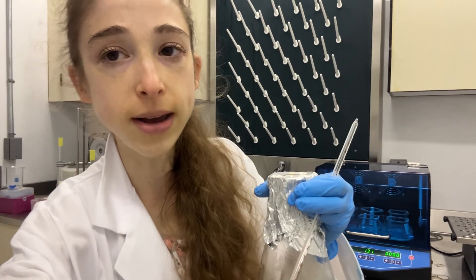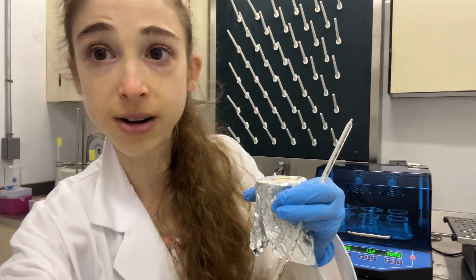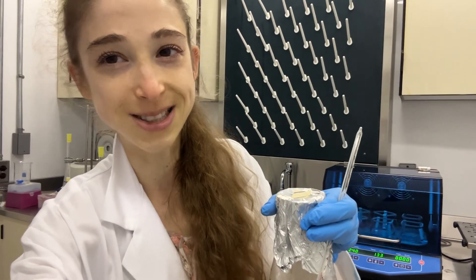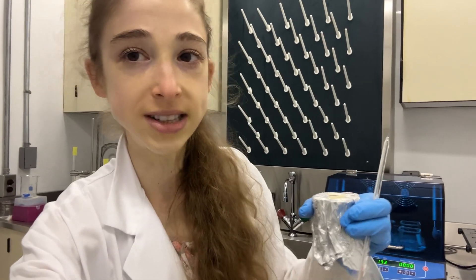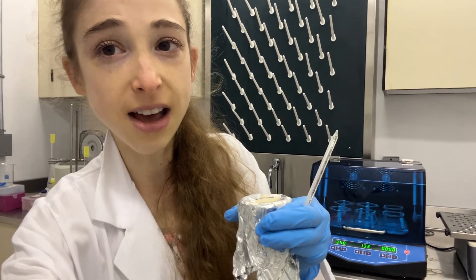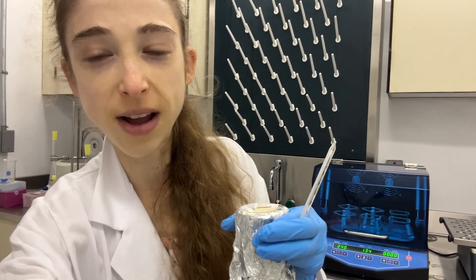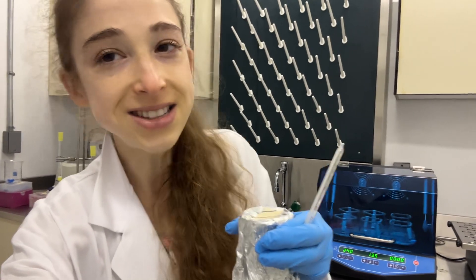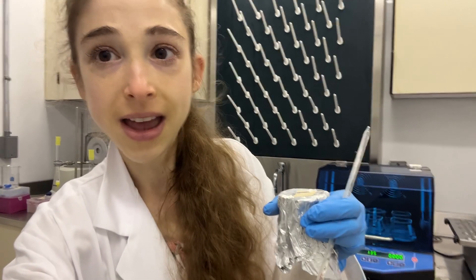Sticking an incubator into a cold room can be a cost-saving technique if you don't have one of those refrigerated tools, though you might need to split your flask into some smaller flasks. I've been doing this starting with a shaker at 37 degrees and then moving to 16 degrees Celsius overnight for protein expression — I tend to have good luck with that. It helps proteins fold properly and stay soluble, rather than doing a shorter expression at a higher temperature. Different proteins like different things, so you just have to find what works for you, your lab, and your protein.